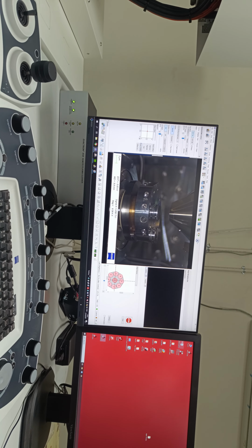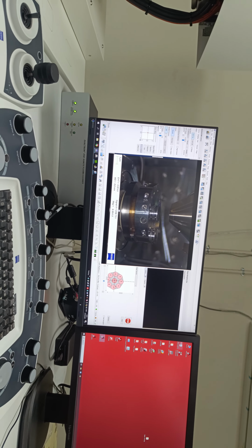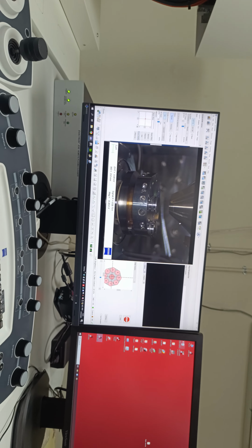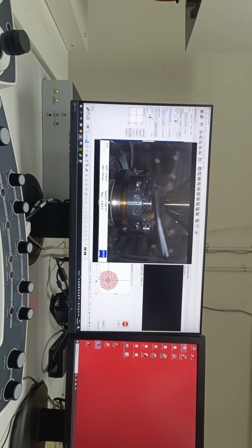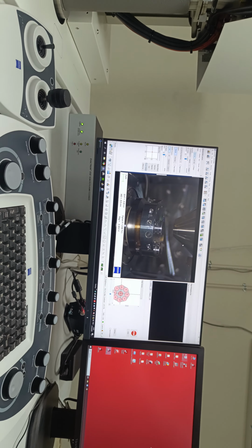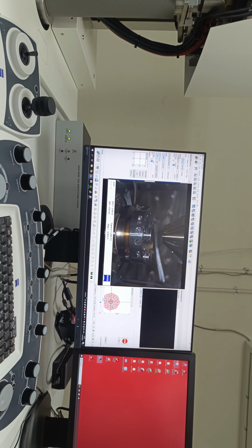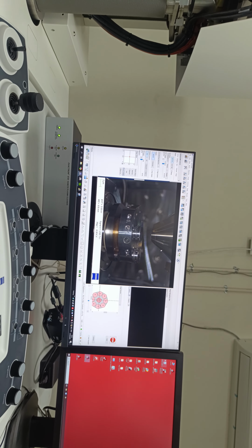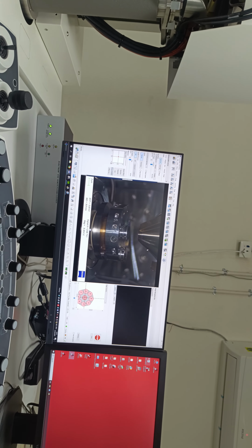It will scatter a little bit, not too much, and reach the sample. So a sample which is a little bit hydrated, or beam sensitive, will not be that much affected.